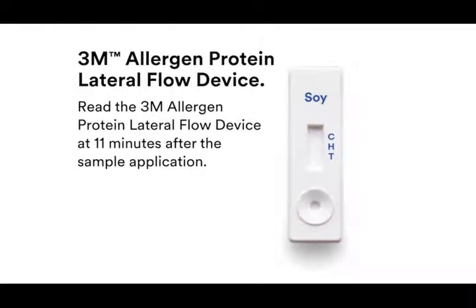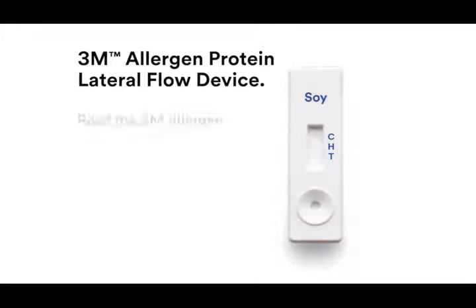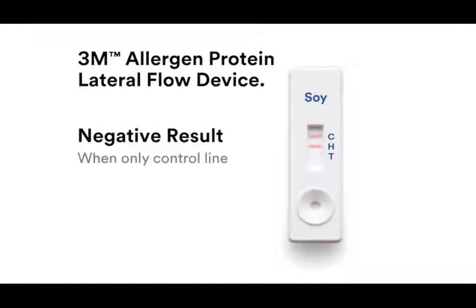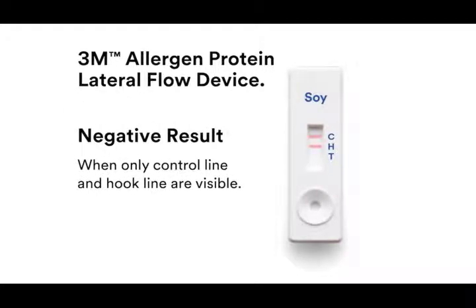Read the 3M allergen protein lateral flow device at 11 minutes after sample application. Any reading after 12 minutes from the initial application should be considered invalid, as a reading at this time cannot be interpreted and can lead to erroneous results. A sample is considered negative for the allergen protein when only the two lines furthest from the well — the control and hook lines — are visible on the device.